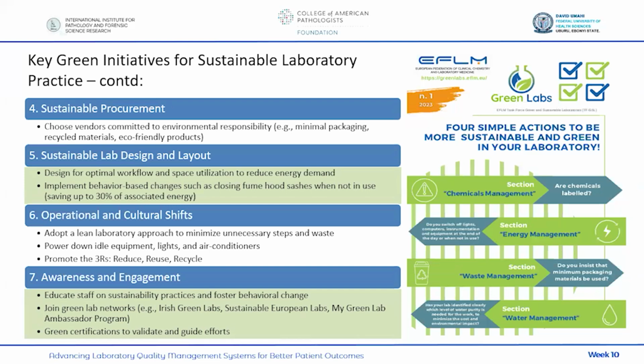What about operational and cultural shifts? Adopting a lean laboratory approach to minimize unnecessary steps and waste. I know one of the sessions in this webinar was on lean practices, so adopting that is also encouraged. Power down idle equipment. When the equipment is not in use, power it down, put it on sleep or idle. Put off lights, put off air conditioners when not in use. It's still the mantra: reduce, reuse, and recycle. Just promote that mantra.